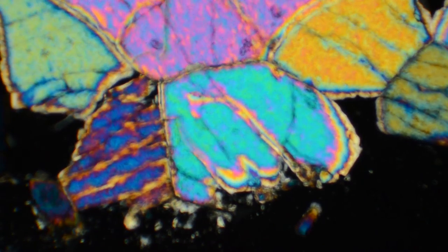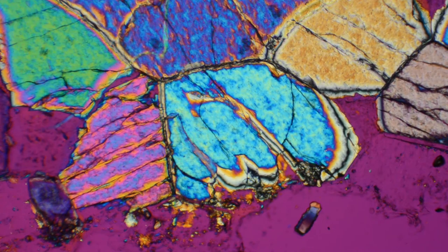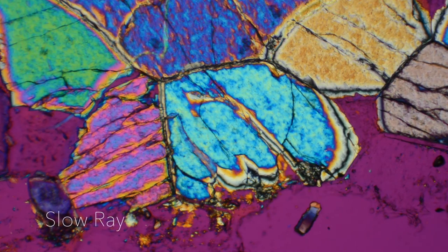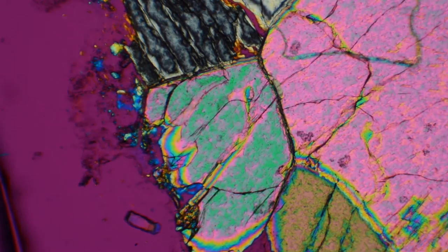Next, I take out my condensing lens and Bertrand lens and switch to a lower objective. Focusing on the same grain, I perform a fast and slow ray determination. Inserting my accessory plate from the southeast, I notice that in this direction, I am looking at the slow ray and in this direction, I am looking at the fast ray.